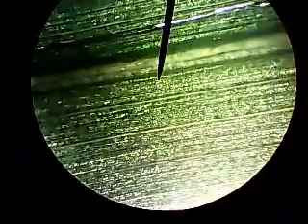That is just like a split in the grass. This is just a piece of grass from my backyard, nothing fancy. You can see the areas where the nutrients are drawn up to feed the grass.